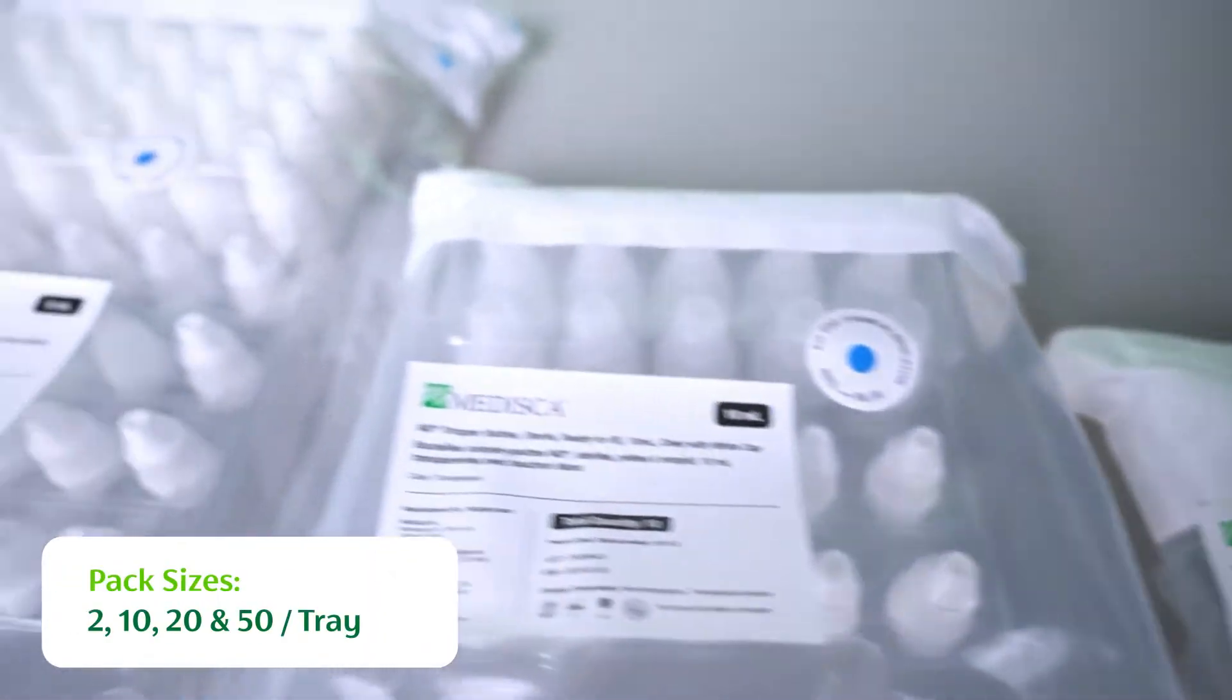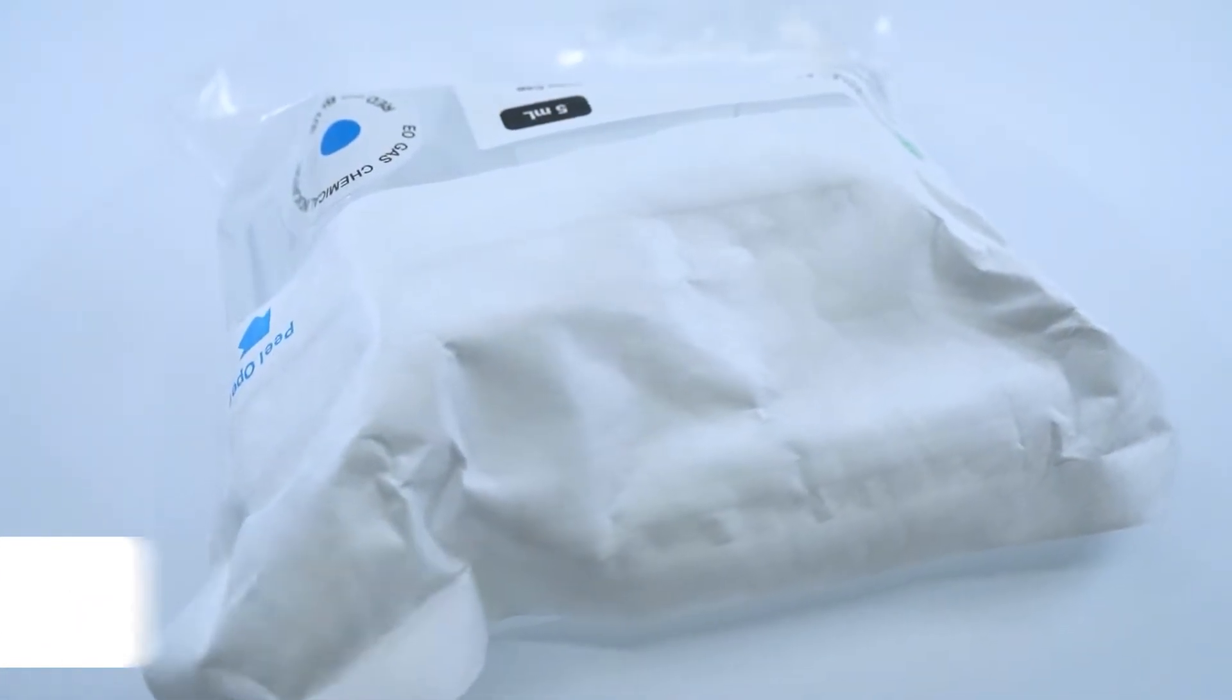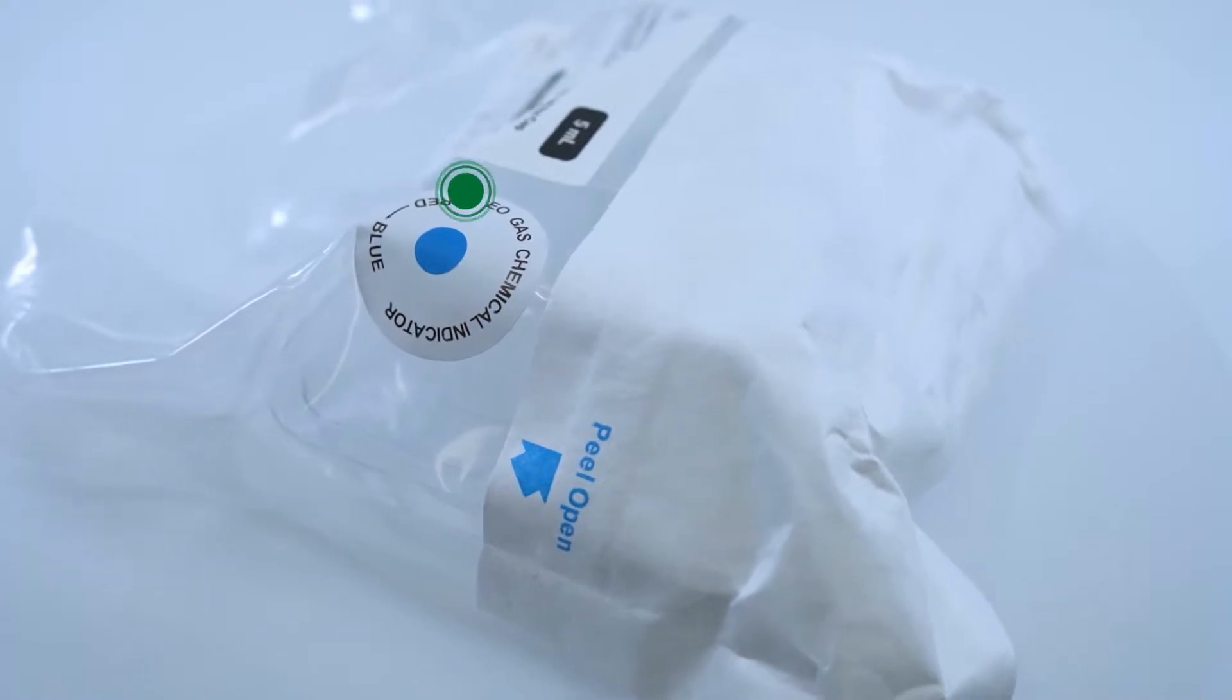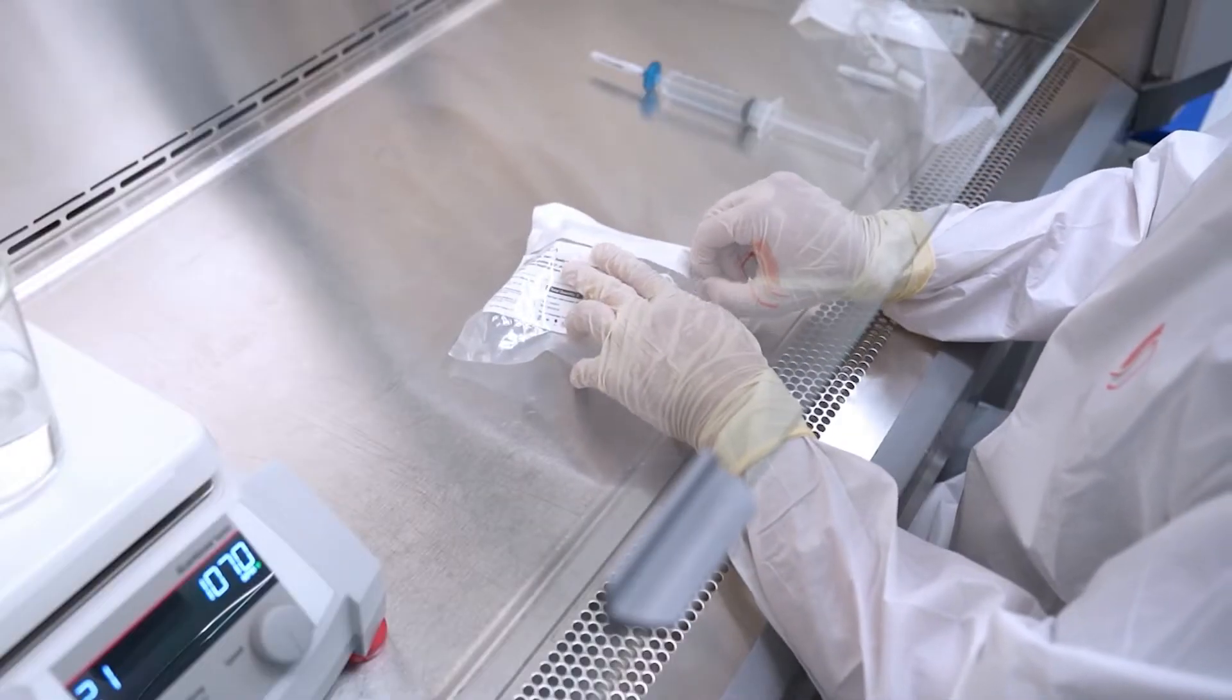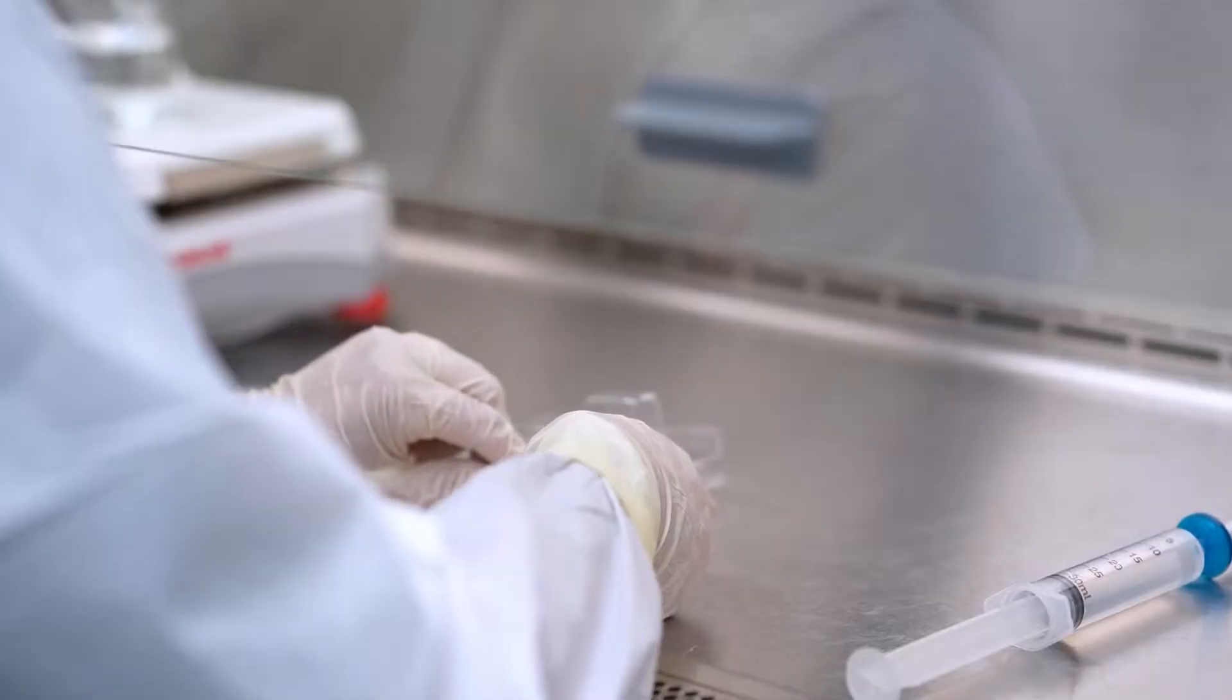Available in four tray pack sizes: 2, 10, 20 and 50. Each tray comes with a single plastic bag with EO sterilized and EO gas chemical indicator. The tear notch in the corner allows for easy opening and use in the sterile environment.